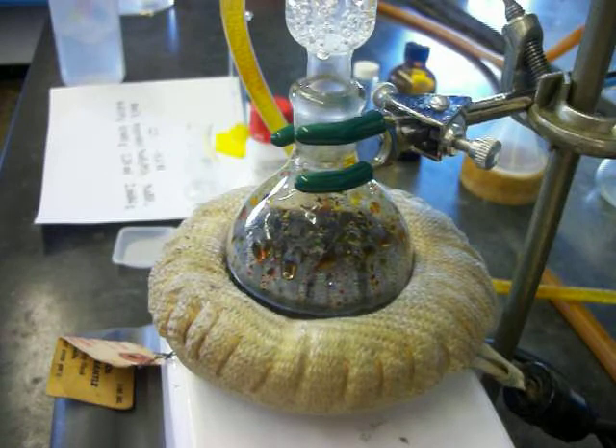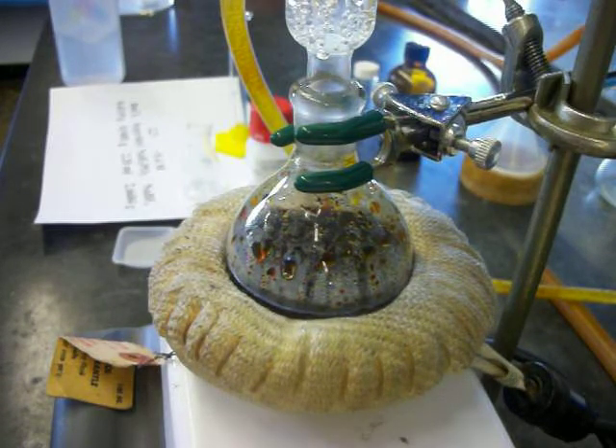Just let that heat up a bit. It will reflux for 3 minutes, and then we will be ready to cool the batch down and crystallize the product out.